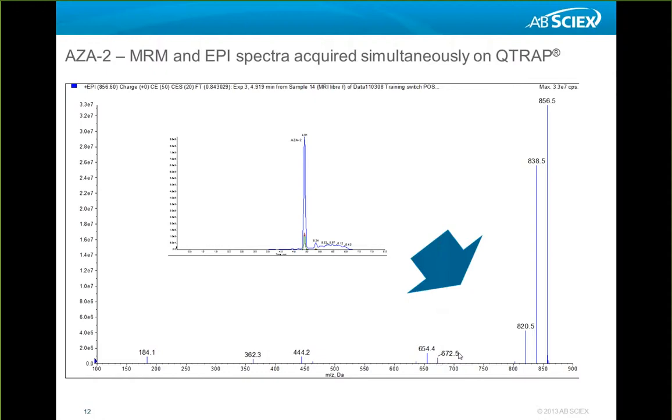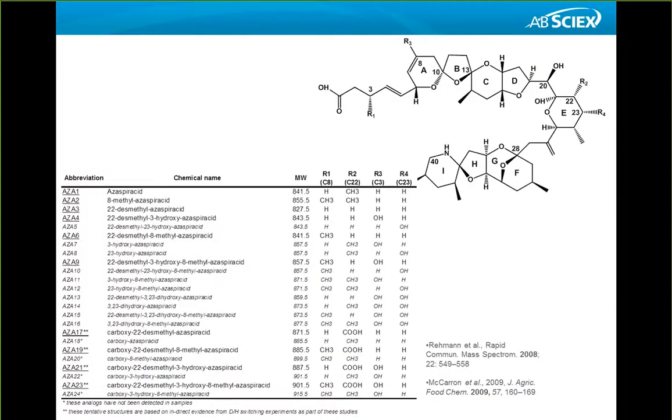for identification. For example, in the azaspiracid metabolite work, we would like to understand structurally related compounds, and look a little bit deeper at what happens inside the shellfish, how this substance can be metabolized there. As you'll see on this slide, the number of azaspiracids is long. We are even exceeding the number 24, mainly methylation, demethylation, hydroxylation, so a kind of cocktail of azaspiracids.